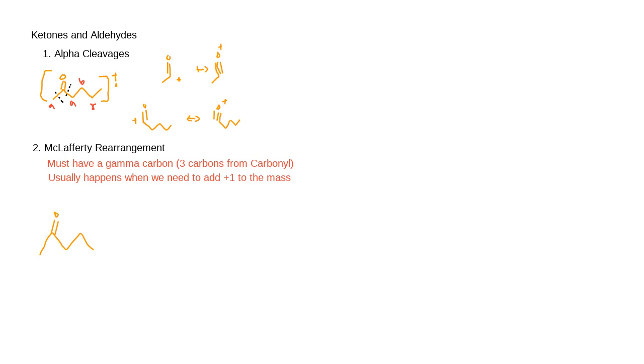And let me label alpha, beta, gamma. I'll just type it out this time, beta, and then gamma, as you know, looks like a Y. Okay. And we are going to rearrange it so that the gamma carbon is right next to the oxygen in the carbonyl so that the oxygen can abstract the hydrogens on this methyl group. I know that sounds a little bit weird. It may look weird, but this is the right way it happens.